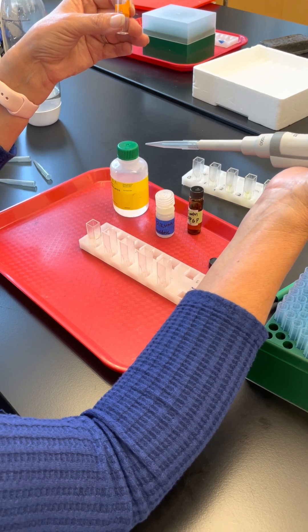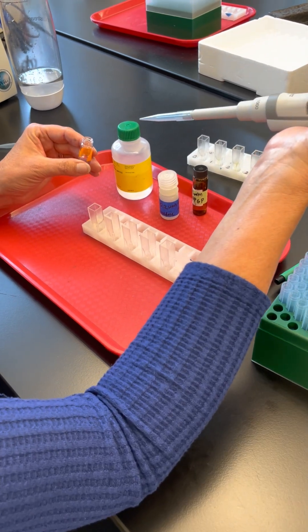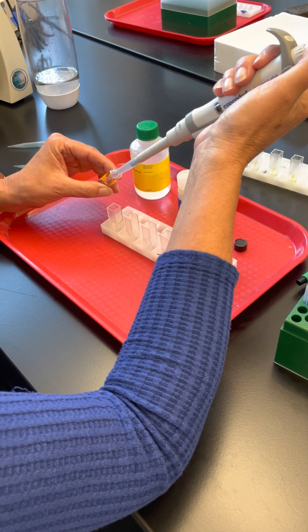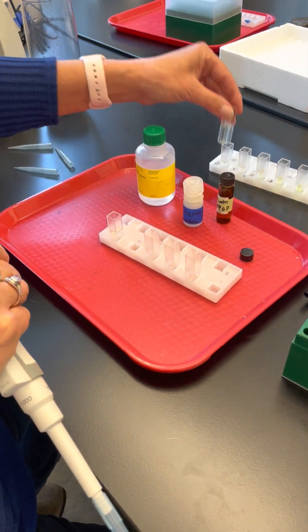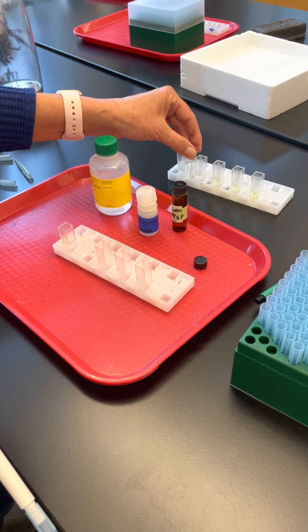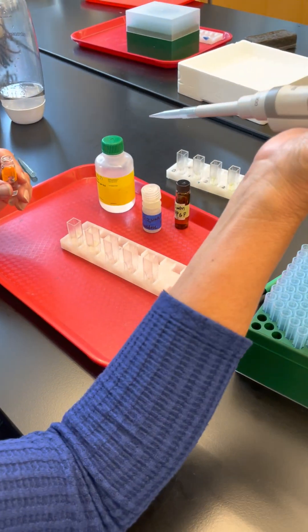We're going to measure how yellow the product is using a spectrophotometer, which gives us a numerical value for the amount of yellow. At the two-minute mark, the color looks comparable to the reference sample, so we'll go ahead and do the next time point at three minutes.